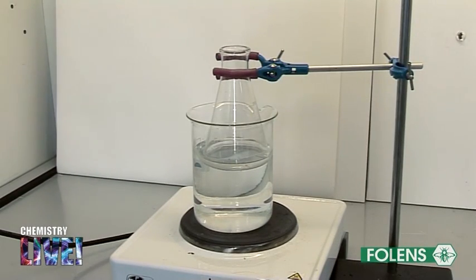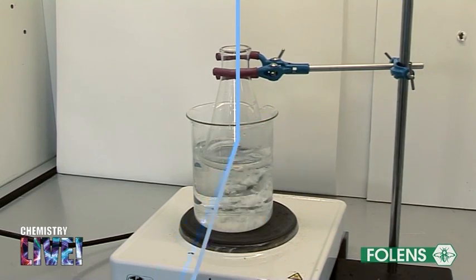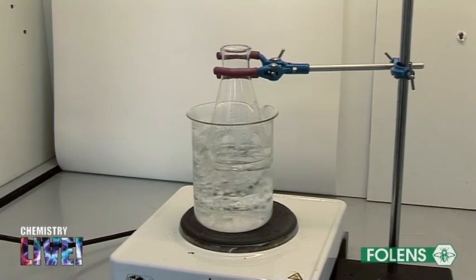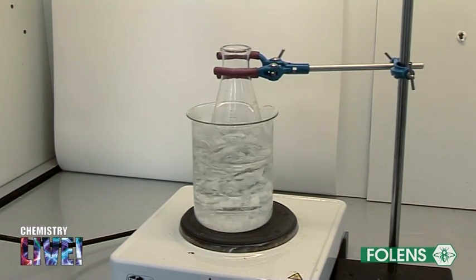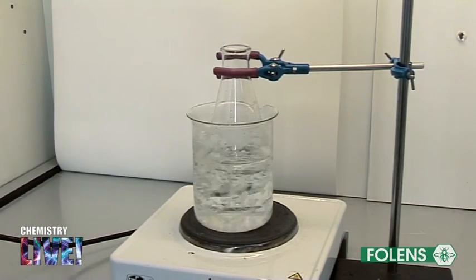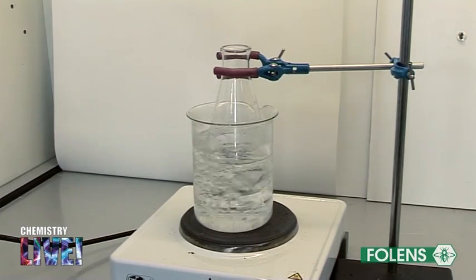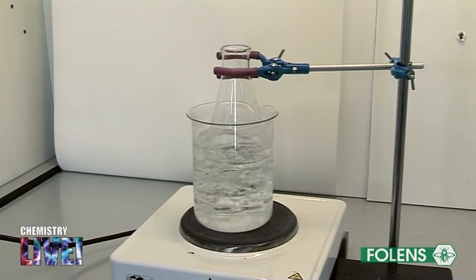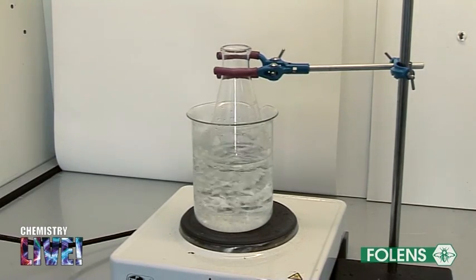In the fume hood, place the conical flask containing the oil of clove solution on a water bath and evaporate off the volatile cyclohexane solvent. Cyclohexane has a boiling point of 81 degrees Celsius. The conical flask must not be heated directly with the hot plate, as this could boil off the clove oil as well as the cyclohexane solvent. Since cyclohexane is a flammable solvent, it must never be heated with a Bunsen burner.